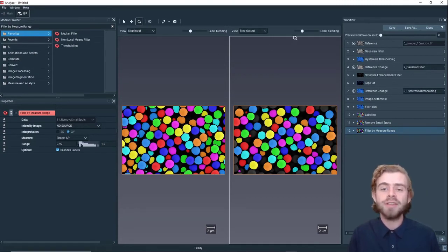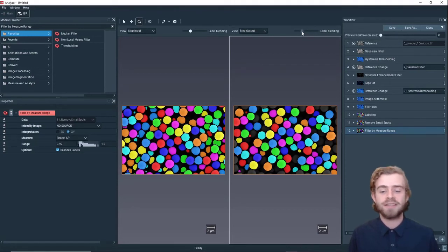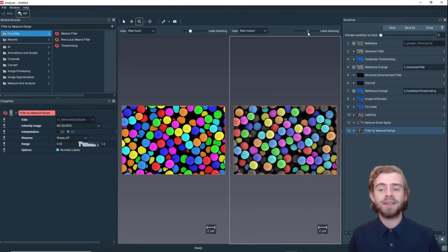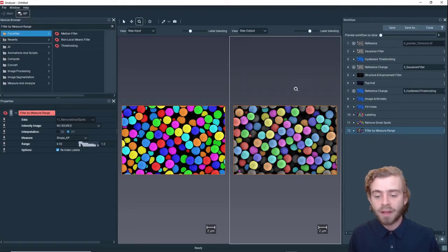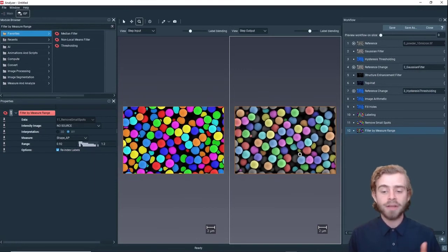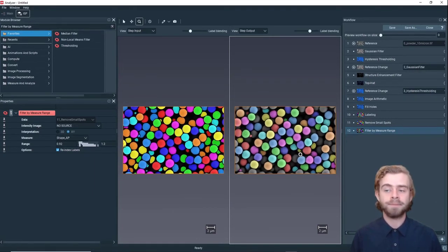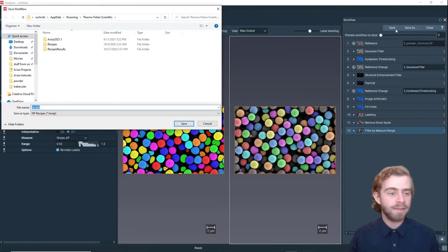Next we can use the Label Blending tool to make sure our final result is still representative of the original image. If we move the Label Blending tool more towards the right, we can see that our thresholding becomes more transparent. This looks pretty representative of the particles in the image, which is great.